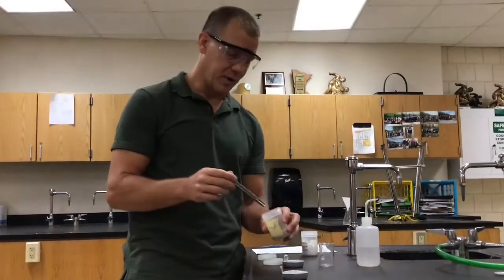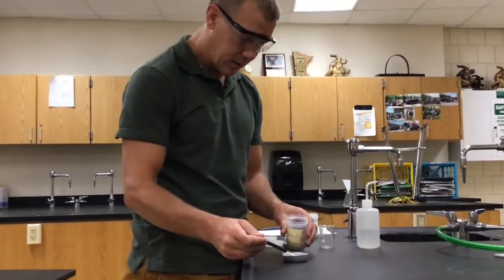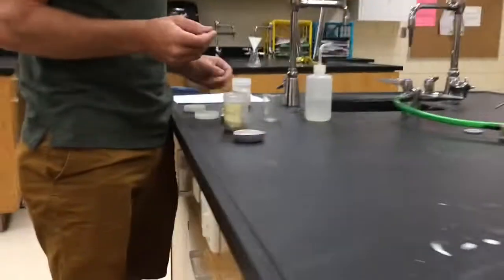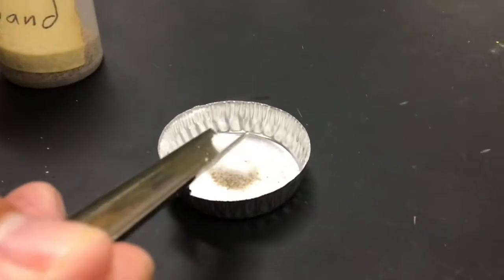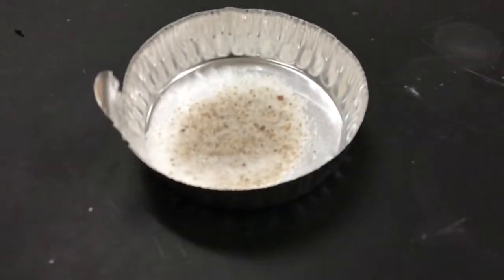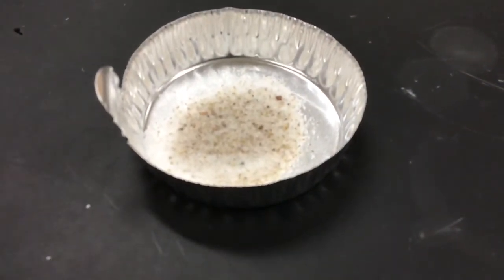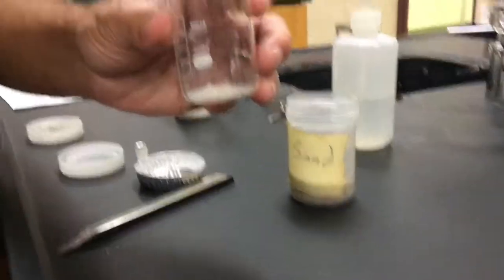For our next experiment, we're going to place a pea-sized sample of sand and a pea-sized sample of salt into an aluminum dish and mix them together. You can look in there and see the salt and the sand separately. Then I'm going to dump it into a beaker.